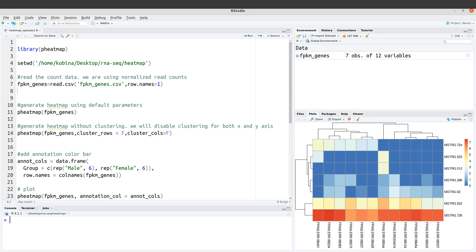Hi everyone, welcome once again to another tutorial session by Informatics. In today's video I'm going to show you how you can generate heatmaps using the R package called pheatmap. Heatmaps are a great way to visualize and interpret gene expression data, allowing you to identify or observe gene or transcript expression patterns across samples or conditions of interest.